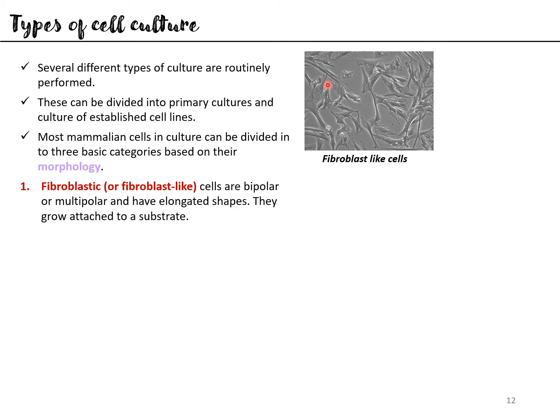So this is what they look like when visualized under the phase contrast microscope. If you recall the contamination images we were just seeing, those were of fibroblastic cells. You see, they have this typical spindle shape characteristic of fibroblasts, and hence the name.